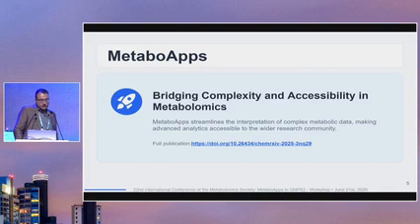The idea of some of those, especially for this workshop where I'm going to present the web version of them, is to give you easier access to the interpretation of this data instead of doing the coding or the streamlined process on the platform itself, which sometimes is not easily interpretable, and is not an easy visualization for some people.